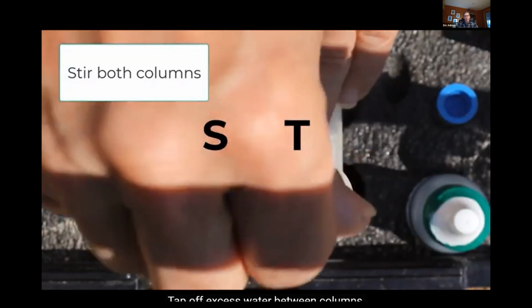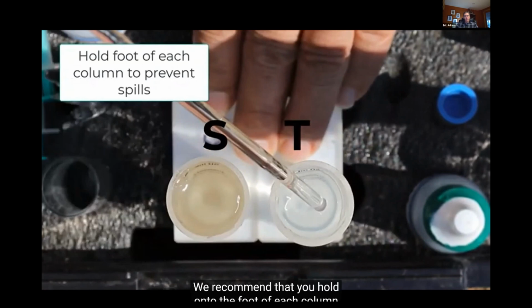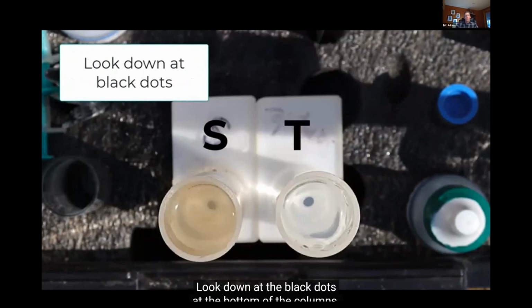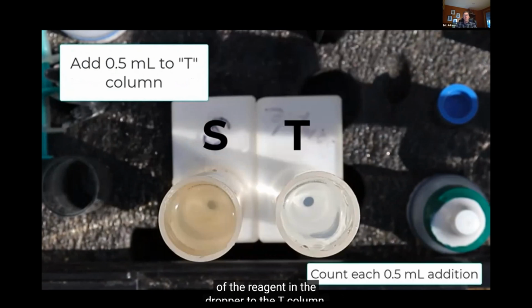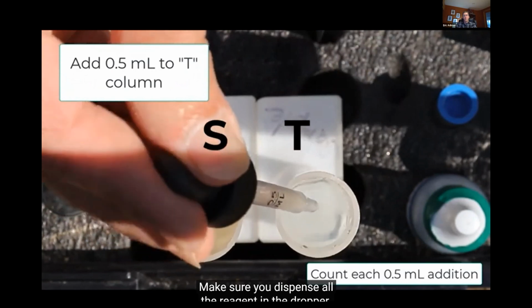Tap off excess water between columns to prevent contamination. We recommend that you hold onto the foot of each column when stirring to prevent spills. Look down at the black dots at the bottom of the columns. If the T column is clearer than the S column, you will need to add the entire 0.5 milliliter of the reagent in the dropper to the T column. Make sure you dispense all the reagent in the dropper.